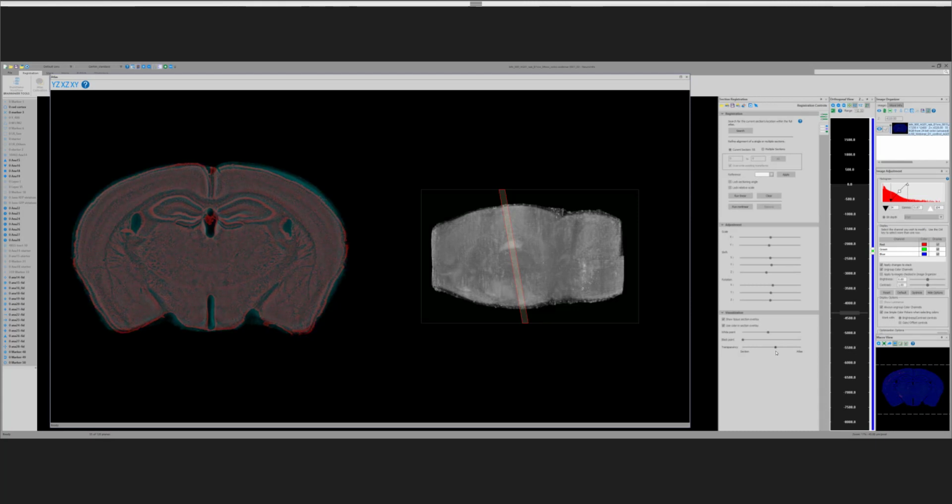So what we're doing is we're trying to find the best fit here for this one. And then the idea is that if we can find this, the same offset should be able to be applied throughout the whole brain. And so the next part of what we do is we see, okay, does this offset, can we apply that to other levels of the brain?